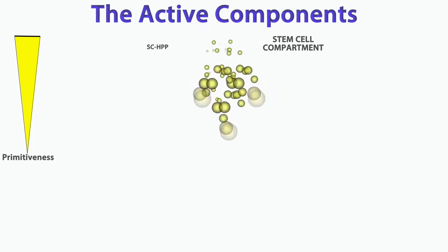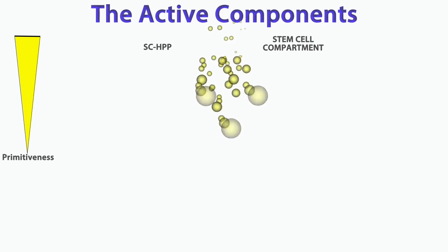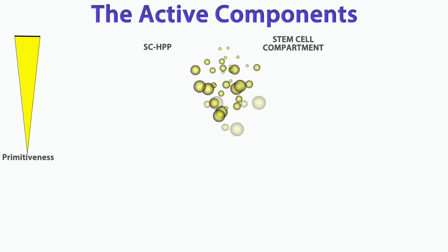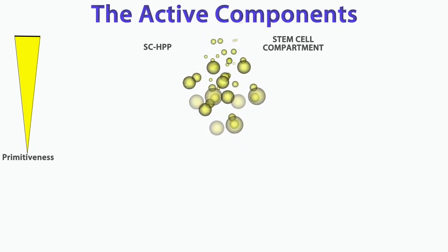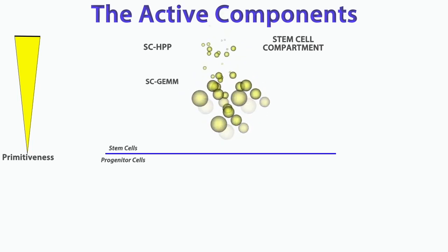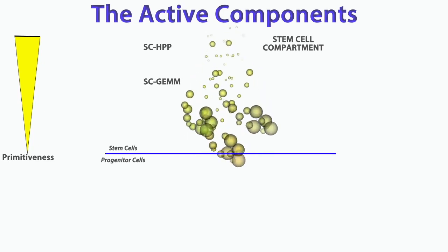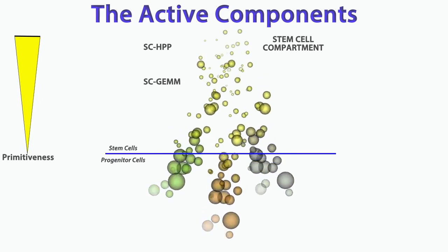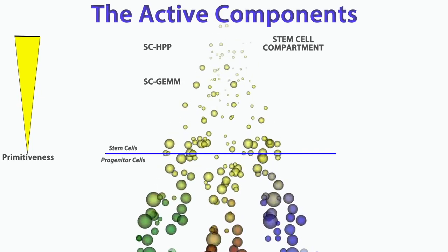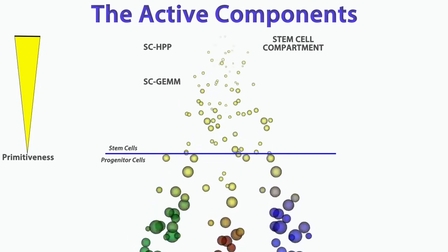The first is the primitive lymphohematopoietic stem cell population, responsible for long-term engraftment and reconstitution, and called SC-HPP, or stem cell high proliferative potential. The second is the primitive hematopoietic stem cell population, primarily responsible for short-term engraftment and reconstitution, because it produces cells of all 3 hematopoietic lineages, resulting in erythroid, neutrophil, and platelet engraftment. This is called SCGEMM and is equivalent to the CFC-GEMM population.